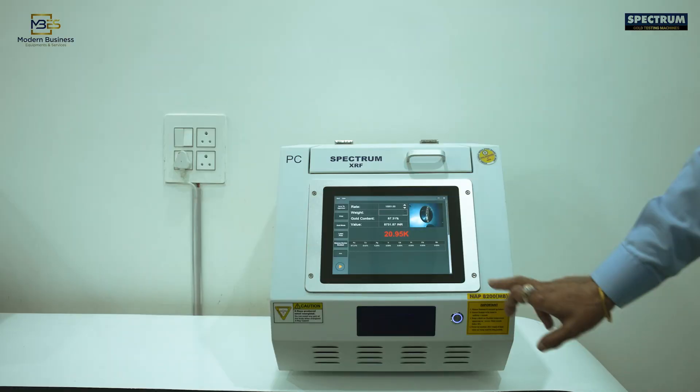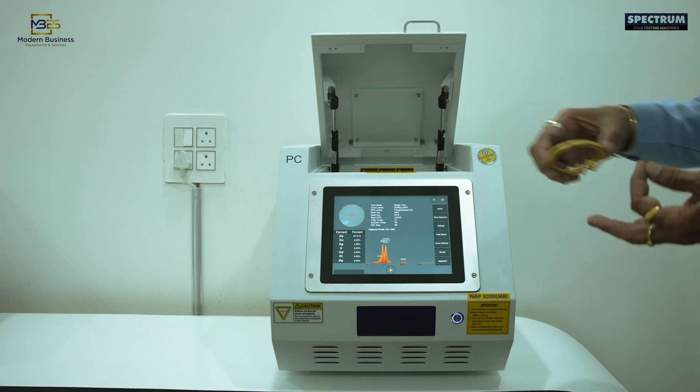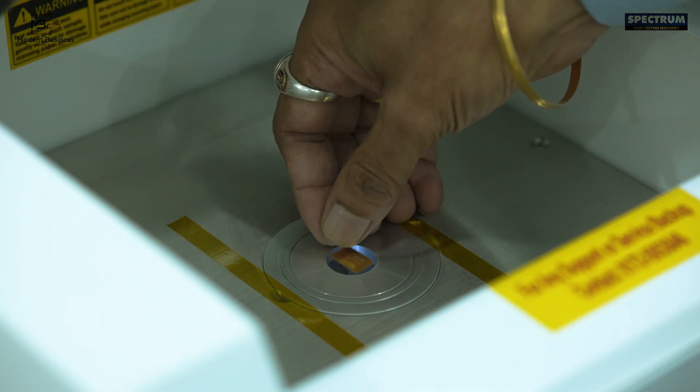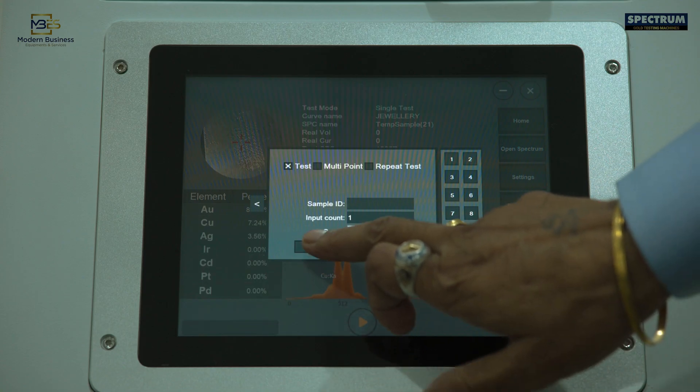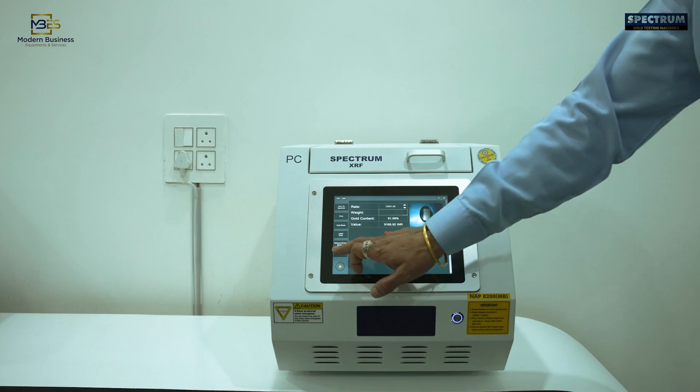Main advantages to jewellery stores: customer confidence in the machine's results, accurately checks old jewellery for buyback, checks fake markings on your new jewellery purchases, and provides a good cross-check on gold issued to Karigars for manufacture.